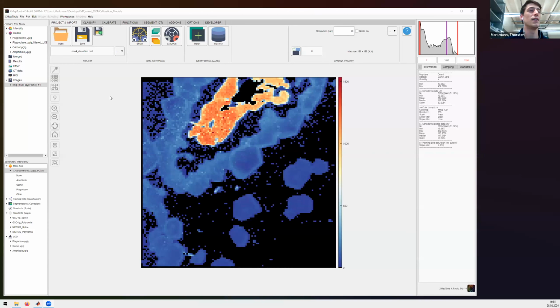Thank you very much, Pierre. I was just finishing with my work. So we are back to the combined map of vanadium, of garnet, amphibole, and plagioclase. What we need now to do is, I want to show you first how can we use the major element data, for example, on the garnet, to express it as the structural formula, this garnet formula, for example, for spessartine. And then in the second step, I want to briefly introduce you to the spider module Pierre has been mentioning. So step one is this, for the structural formula, we have to go to our quantified data.